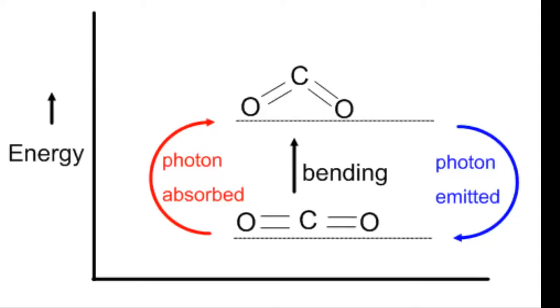And then as we scan across the infrared band of the electromagnetic spectrum, changing the wavelength or wave number of the wave, and therefore the energy of the wave, as the energy comes into resonance with specific vibrations that occur within the organic molecules, then we'll get energy absorbed. And as you'll see shortly, as energy is absorbed, this will produce the peaks in the infrared spectrum.